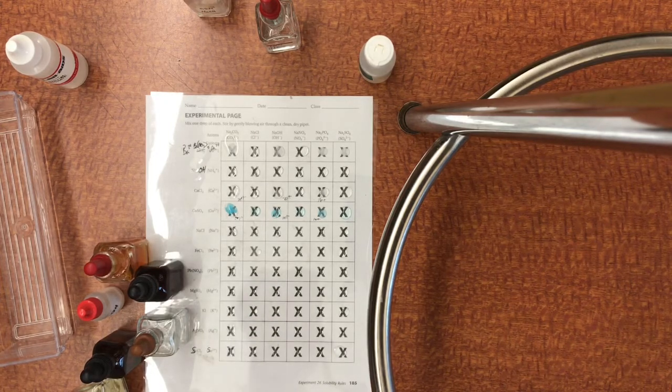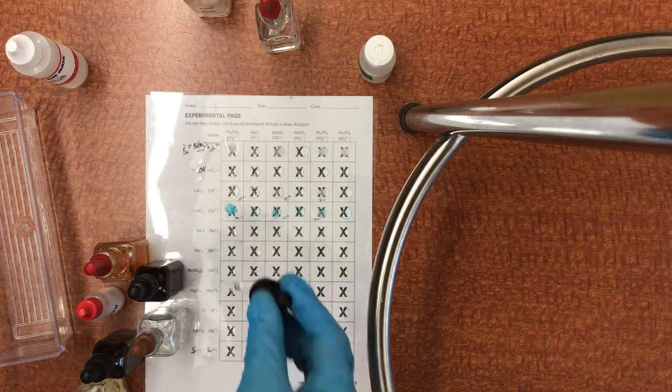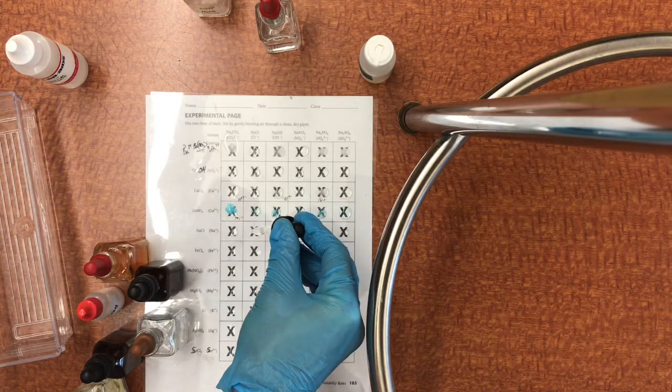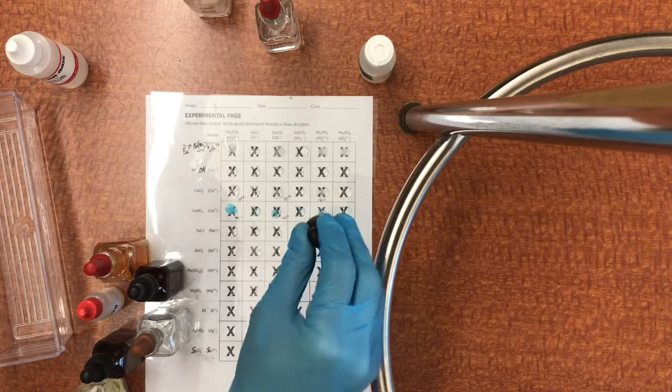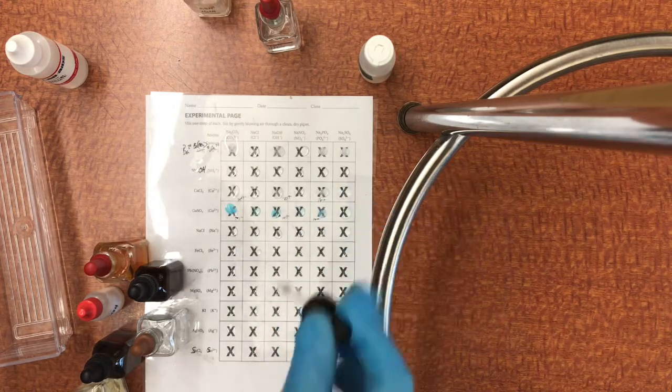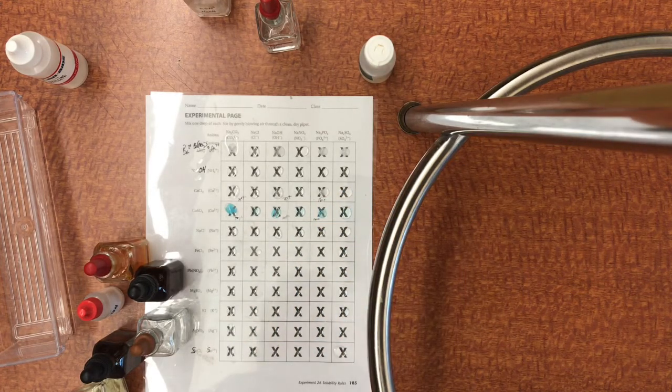Okay, I've got some sodium chloride here. I'm going to put that across. I'm expecting almost no reaction because, in fact, I expect absolutely no reaction because sodium is soluble with essentially everything. And so there's the case. There's no reaction. Very unexciting.